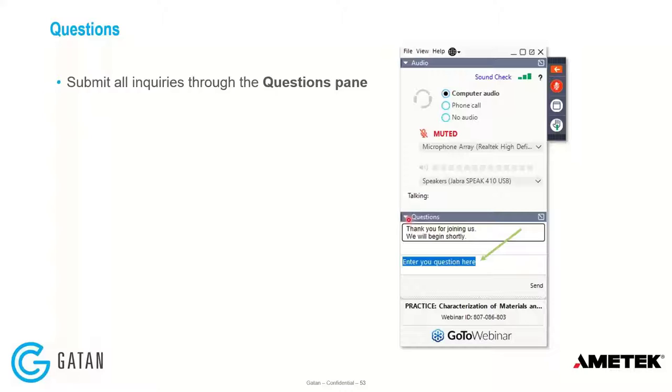One question that was asked was, which TEM do you use in the lab? I think it was specifically for the FinFET data or the 3D NAND data. So what instrument were you using? Which microscope? Well, what I can say is this is a Gatan EELS spectrometer, right? And for our lab, we use the Thermo Fisher TEM. But I think as long as you have a good environment and a proper setup, proper alignment, either Hitachi or Thermo Fisher or JEOL can probably do a similar type of job. Yeah. And then is it probe corrected?